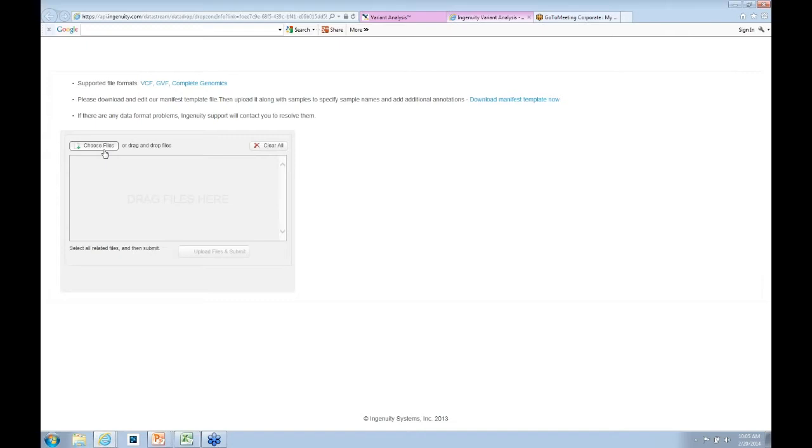One of the things I've noticed is about half the time this window does not appear because pop-ups are blocked. So if you want to use that high volume data uploader, just make sure your pop-ups are enabled and you're allowing this additional browser window to pop up.